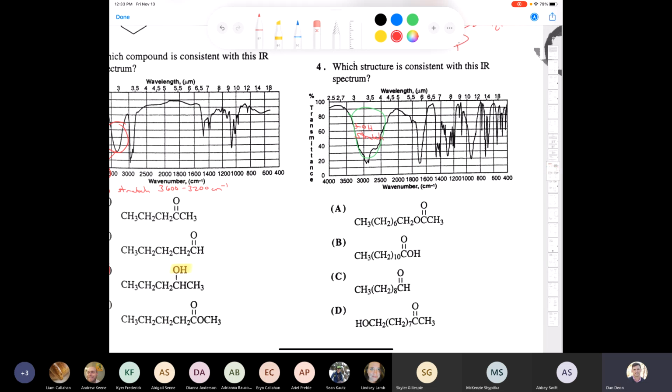So we'll say this is an OH stretch, but this is from a carboxylic acid. So we'll put carboxylic acid OH stretch, right? Because that's very broad because of the pronounced hydrogen bonding. It's usually in the range of 3,300 to around 2,400, a very, very broad range. Okay, what else do we see? We have a nice big signal here. This is a carbonyl, right?